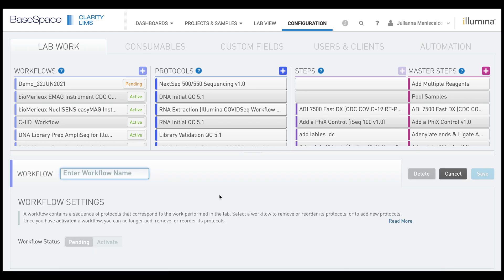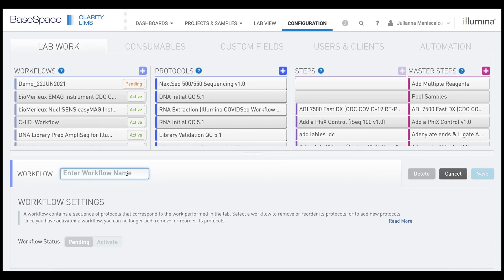Then you're going to scroll down and you will need to give your workflow a name. And then you'll need to click Save.